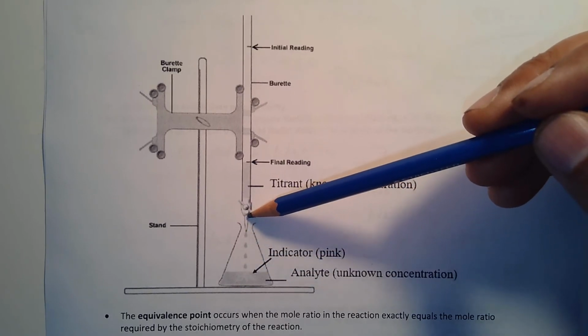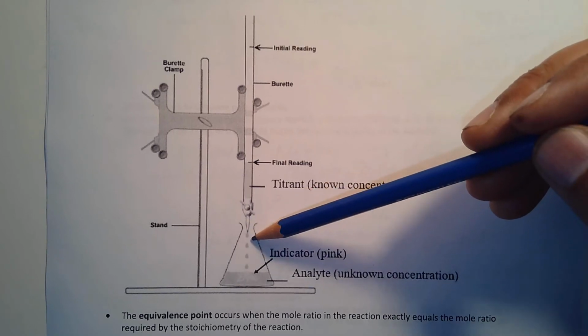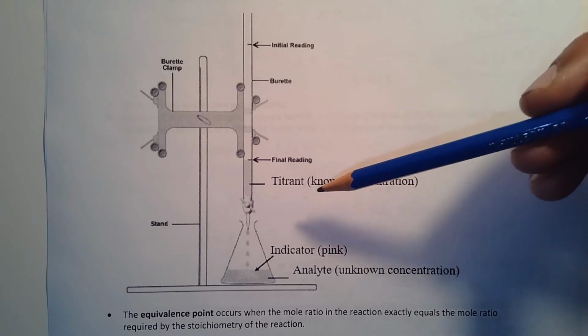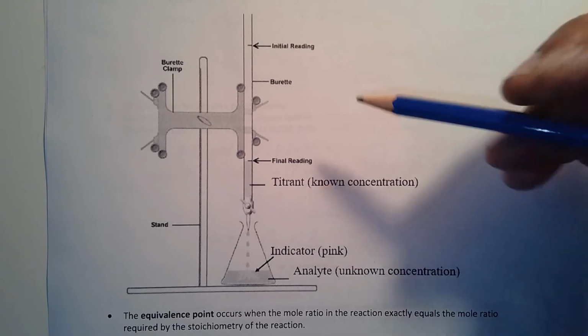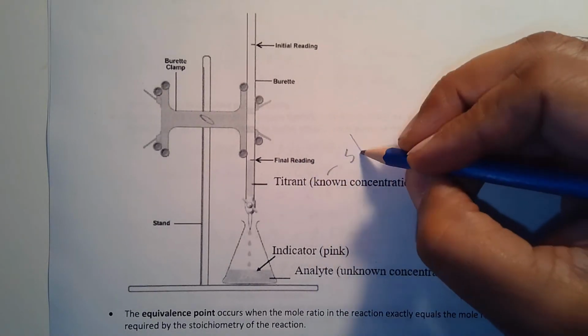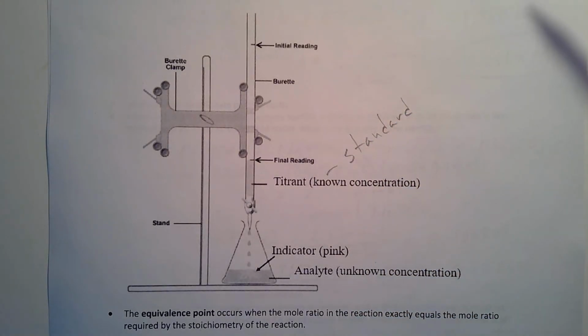If it's opened all the way, it'll drain out really fast, and if it's partially open, it'll go dropwise. We call the solution in here a titrant. It has known concentration. The other word for the one that has known concentration is the standard.